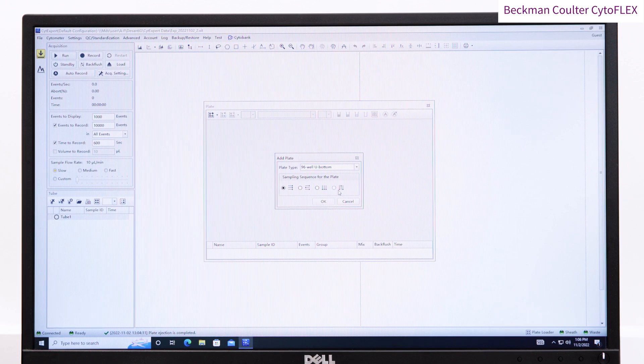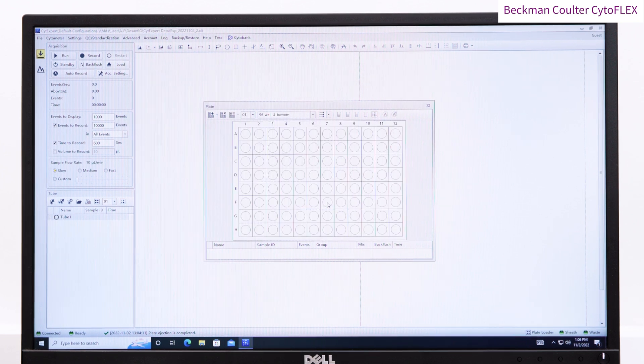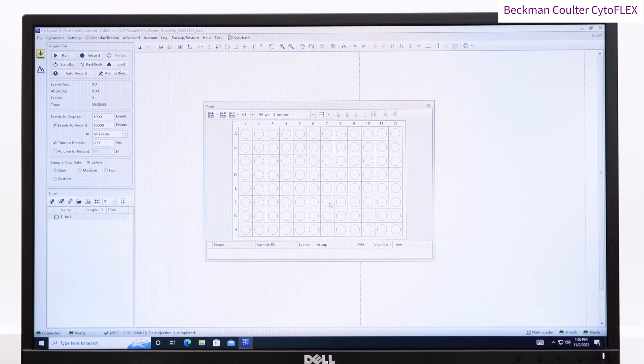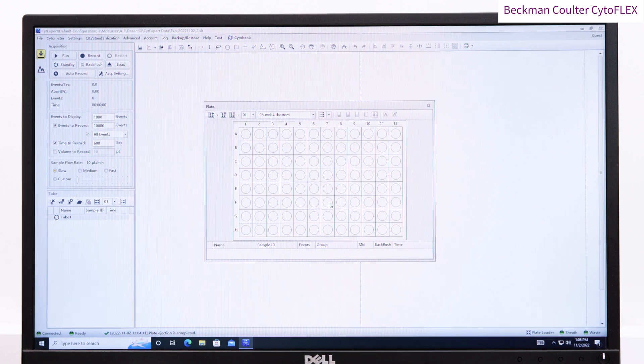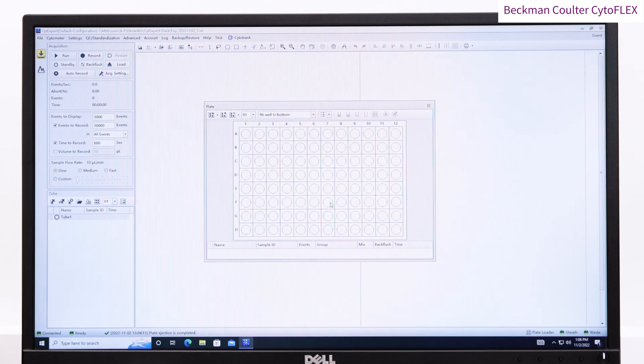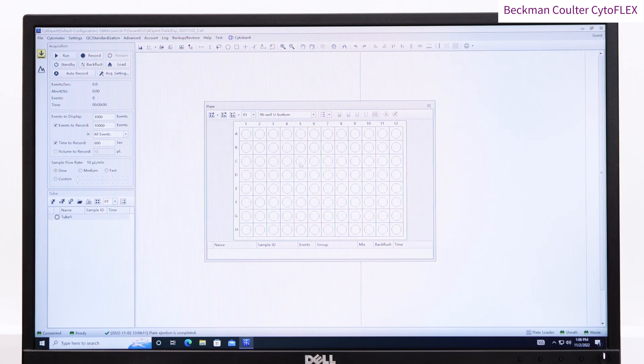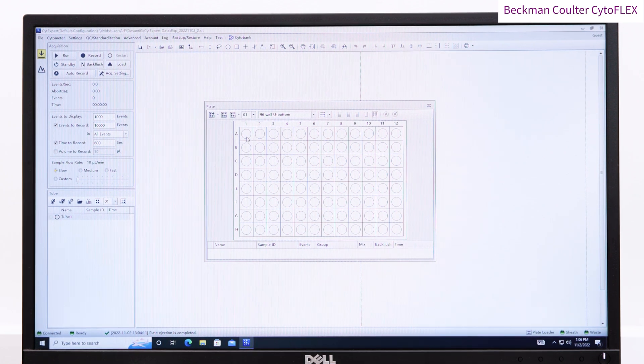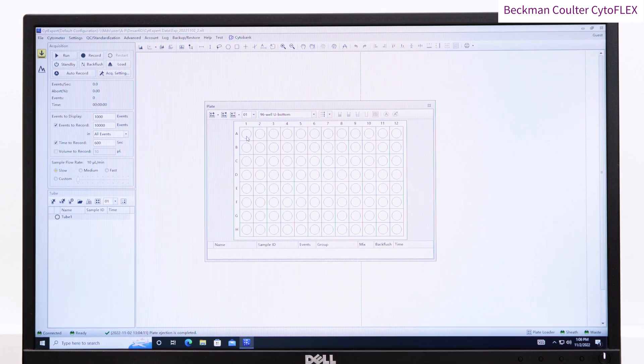Also consider the stopping conditions. You may wish to set a time or volume alongside your cell number, and these can be different for individual wells. Once you are happy, press OK, and you will see a list of the wells on the left-hand side.